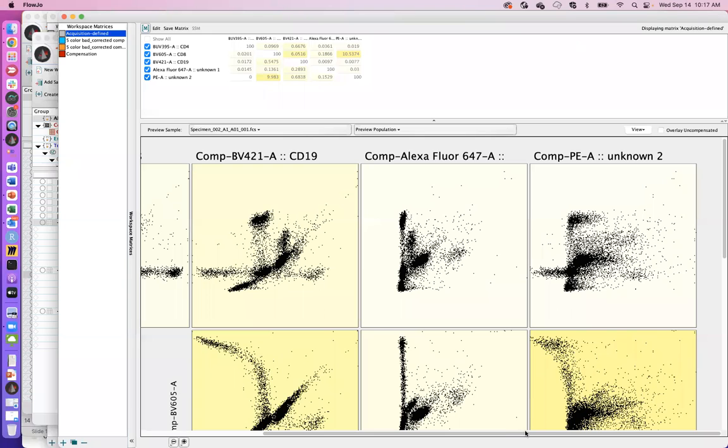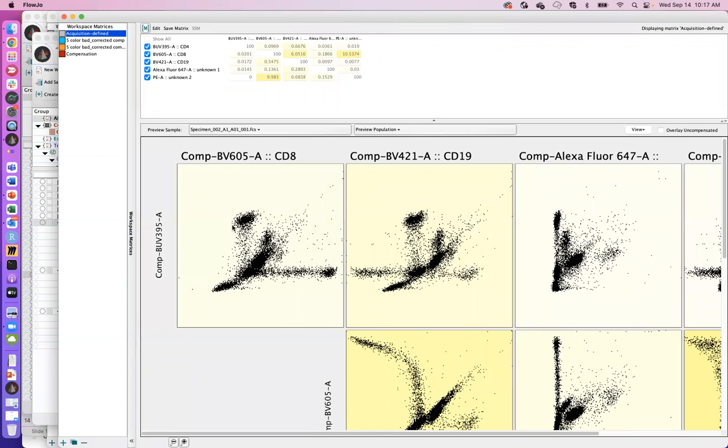A little less obvious is if we look at these plots on the left, we have a nice round single positive population here, a nice round single positive population here. But if we walk these populations back, again looking at the middle of these populations and walking them back towards the double negative, where they sort of intersect here at this population in the center of the plot.